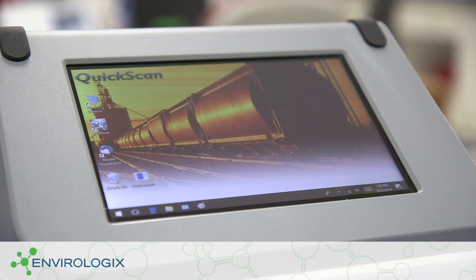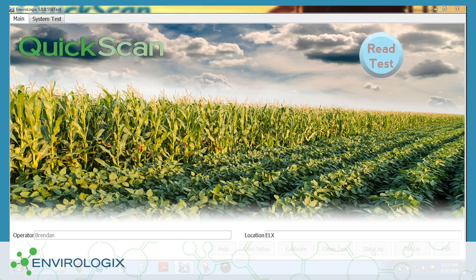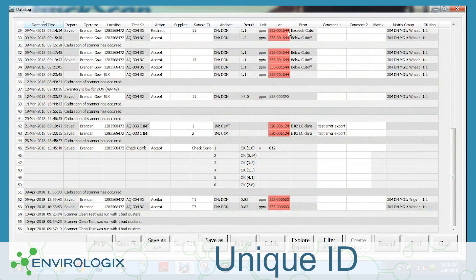Along with physical improvements, there were many new features in the Quick Scan software. Here are just a few. Some products are encoded with unique serial numbers, allowing the software to highlight any that are scanned more than once.